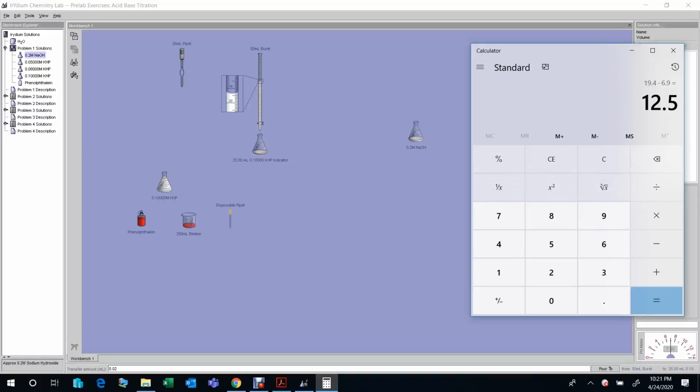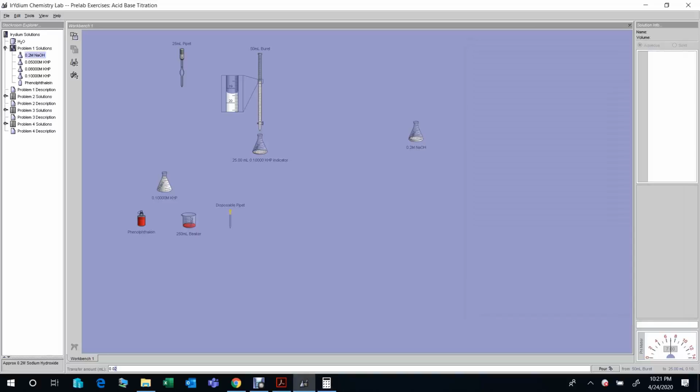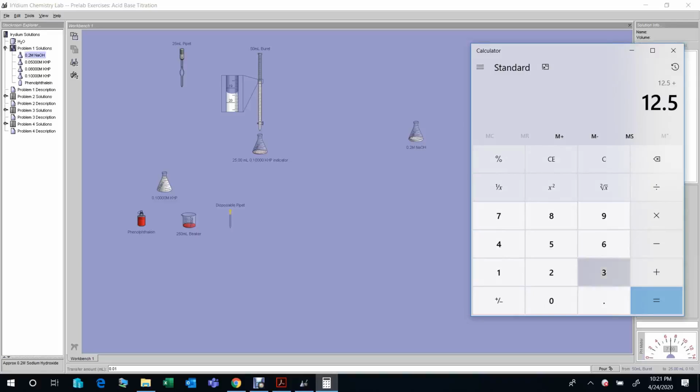Okay, you see, I feel there's some color change already, but if you're not sure, this very slight color change is good enough. If you're not sure, then we can add maybe 0.01. Let me see. You see, the color changed more. Or you can choose this as the equivalence point if you're not comfortable with the slight color change. And sometimes we can overshoot. That's okay. So we add 0.01. So that is the volume we use to finish the titration, right?